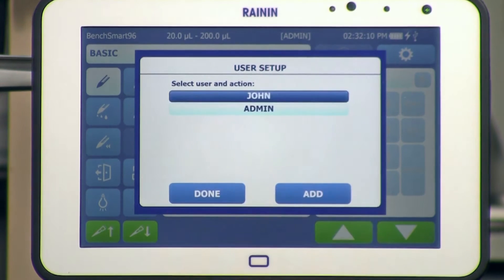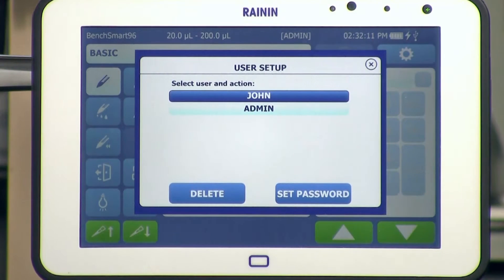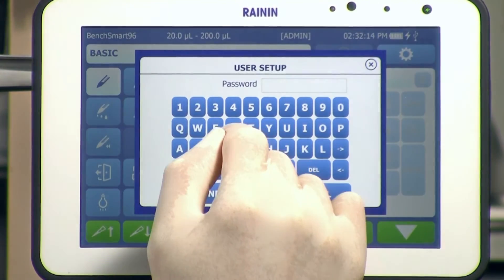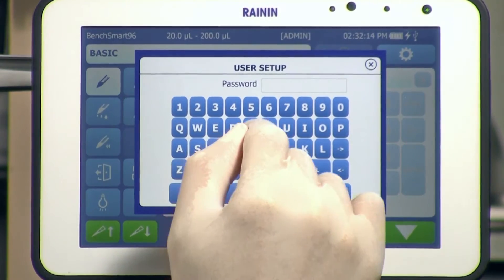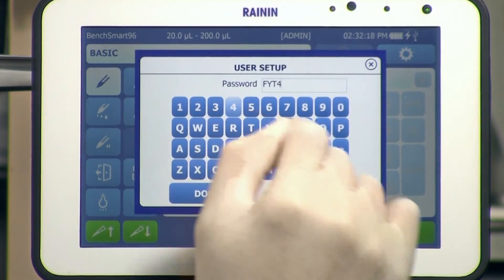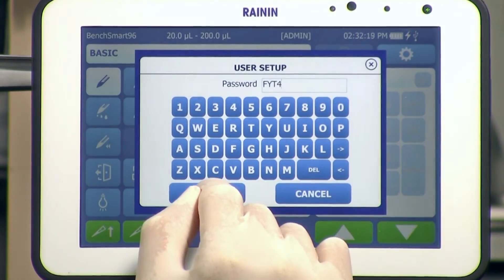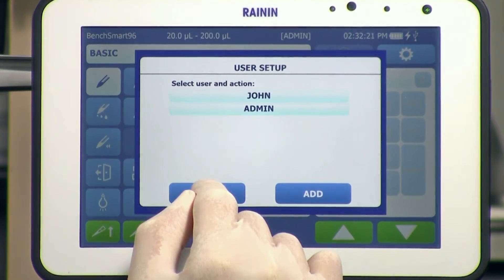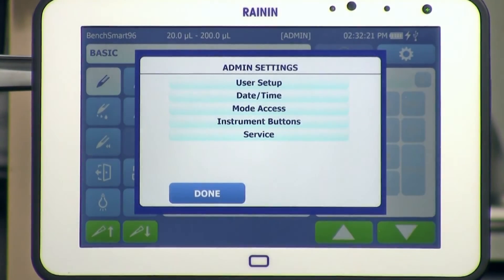To set a password, tap the name you just added. Tap Admin if you want to set a password for admin. Tap Set Password, then type the password, and tap Done. Tap Done again to exit user setup.